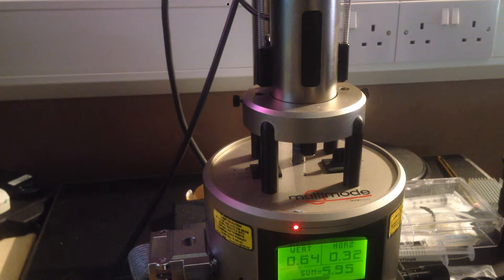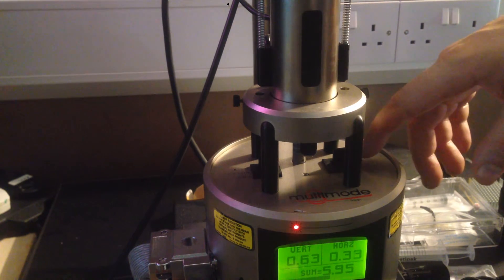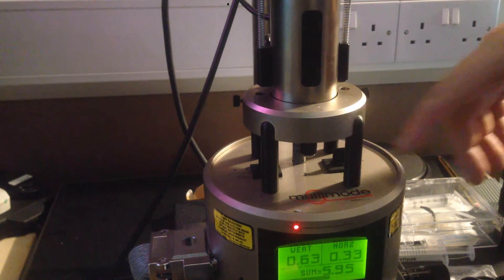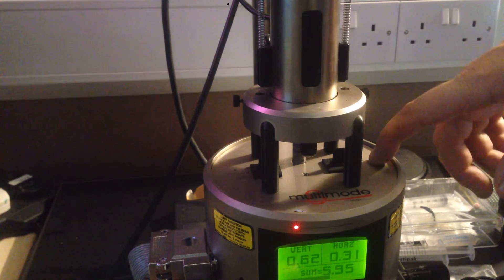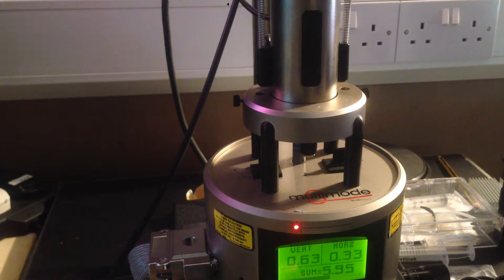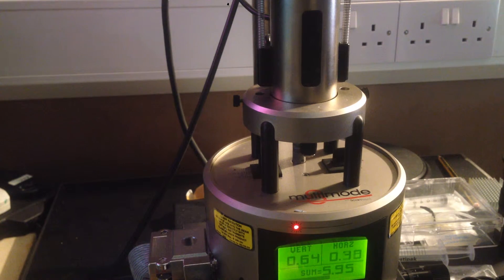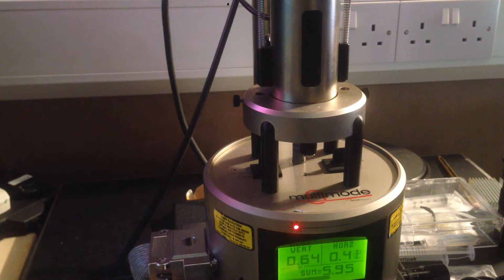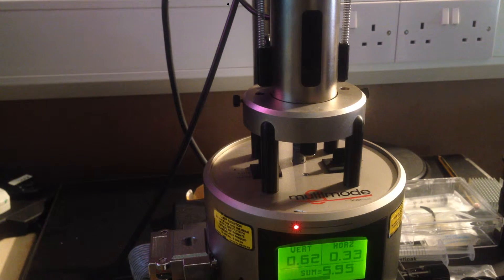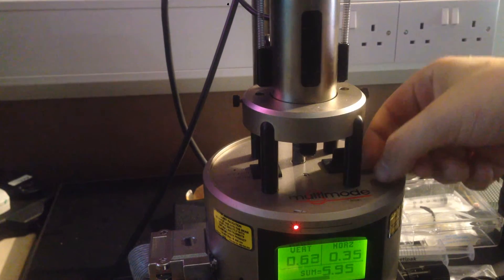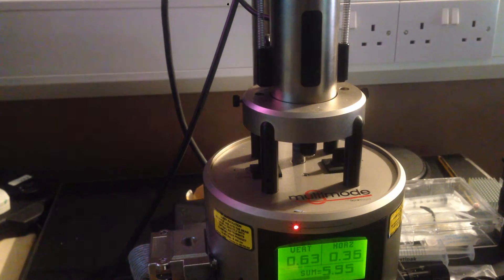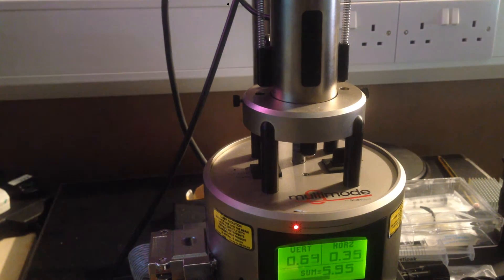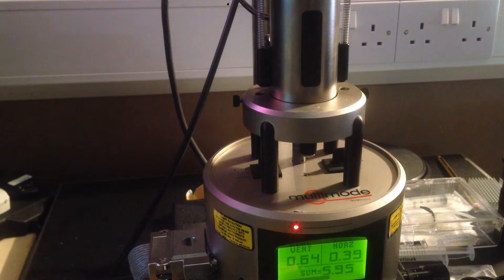But basically, when you set things up, you should initially have the stage down, so it's way away from the cantilever. The sample is on the stage and it's below the level of the cantilever.